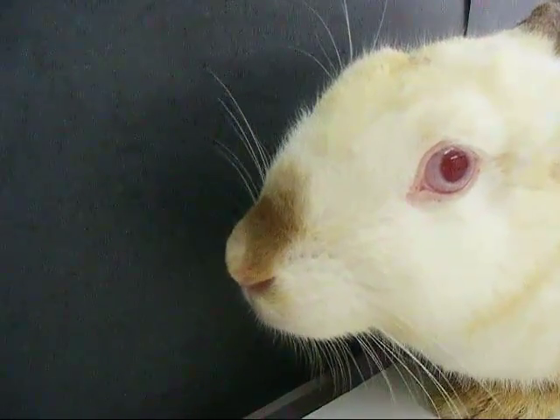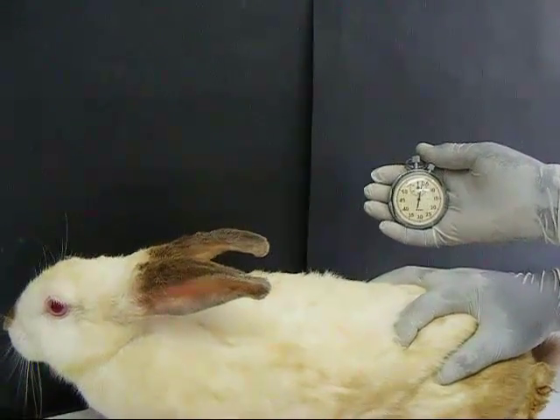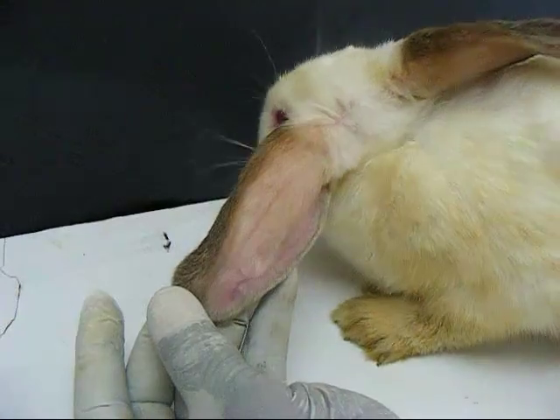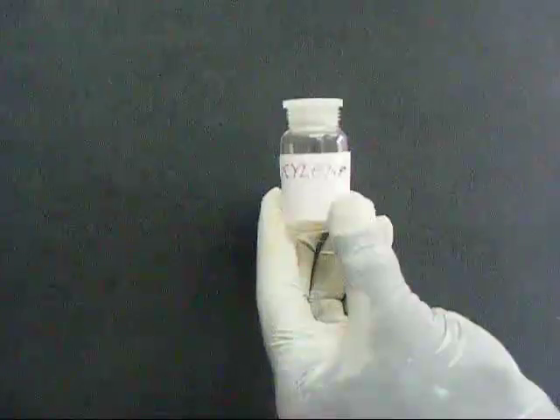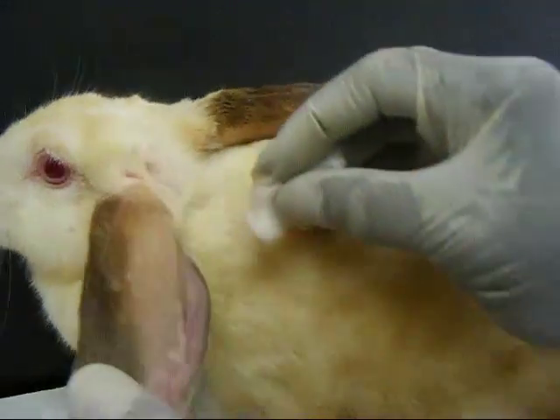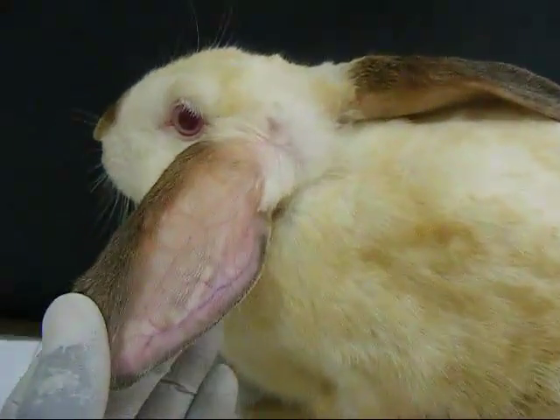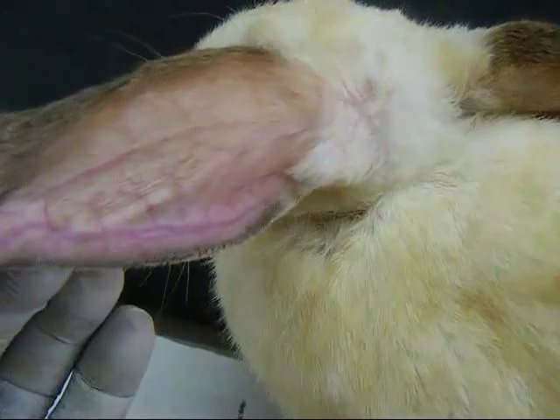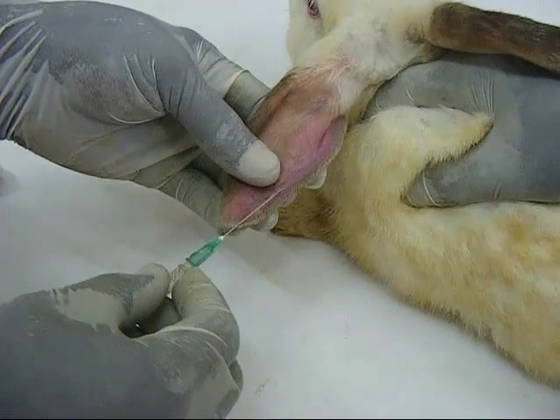Observe the pupil size. To start the experimental procedure, the normal respiratory rate of the rabbit is determined. For the ear vein to show prominently for intravenous injection of morphine, the margin of the ear is rubbed with xylene. Morphine at a dose of 15 to 20 milligrams per kilogram is then injected into the marginal ear vein.